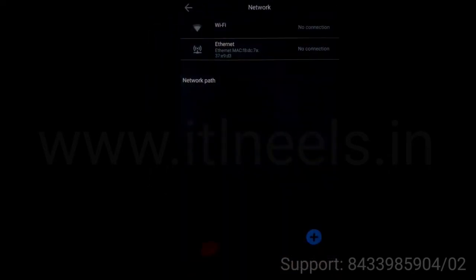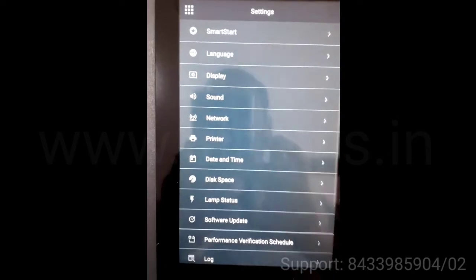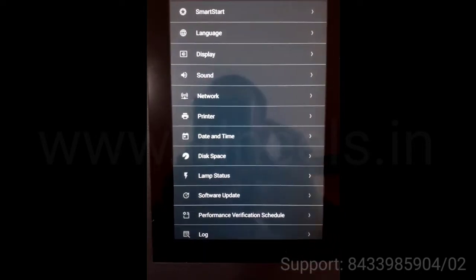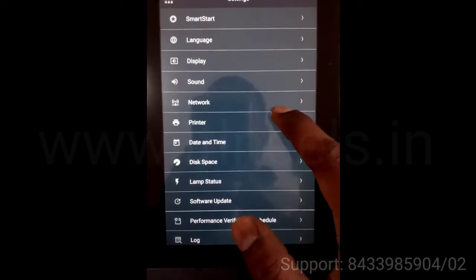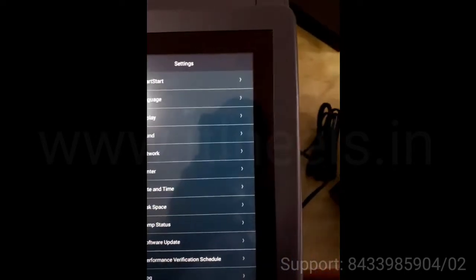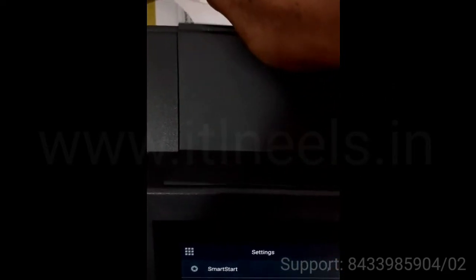It has an Android interface. You can attach a printer also. To attach the printer, you have to remove this section.